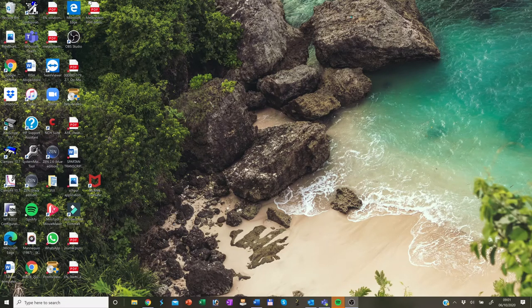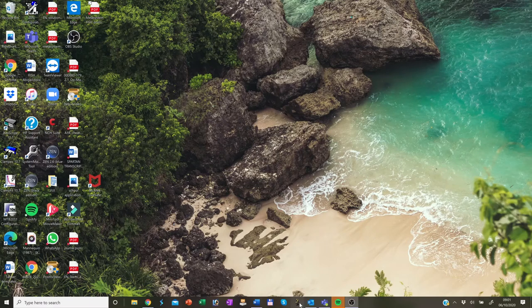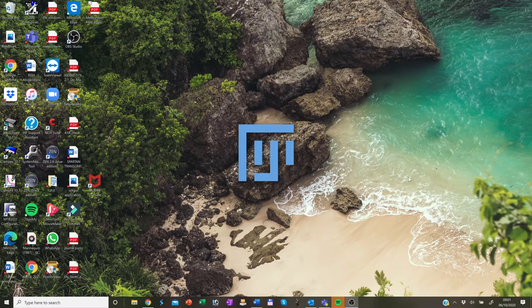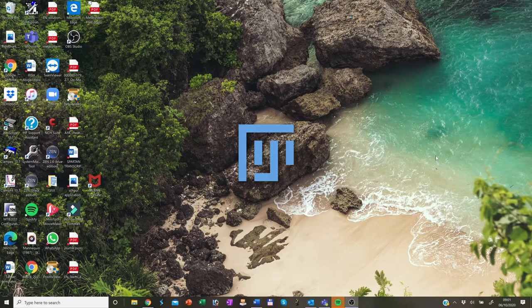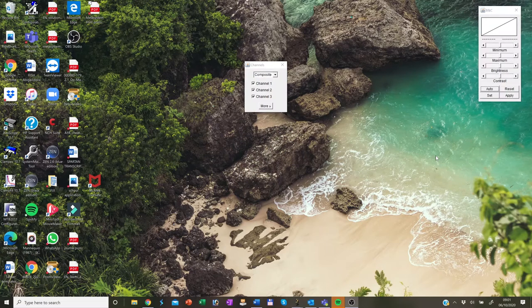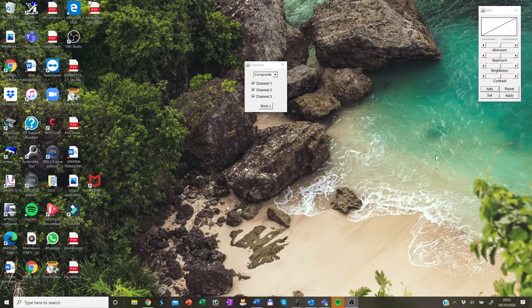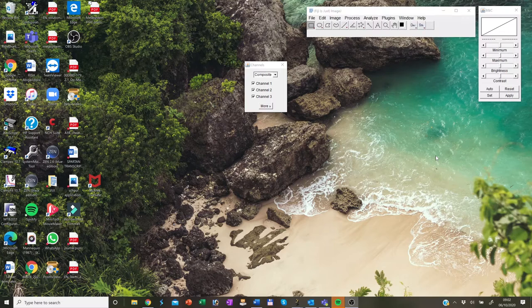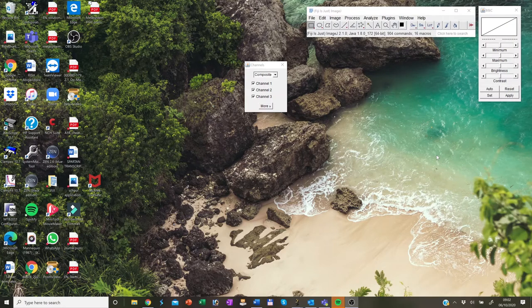So let me just open the software. Here we go. So this software itself is an open source tool which is freely available, and it can be easily installed, and it is supported by Windows, Mac, Linux operating systems.